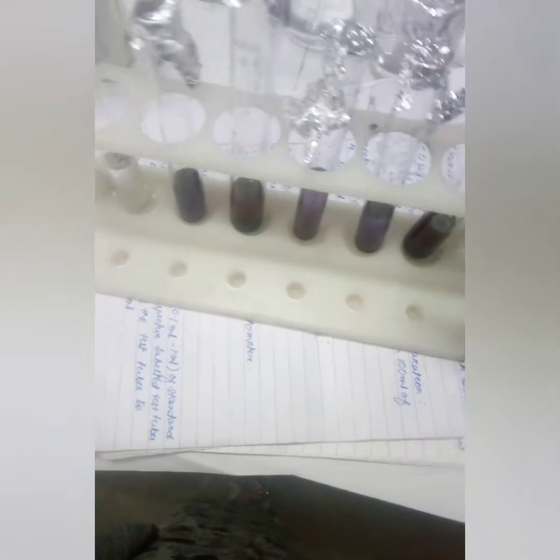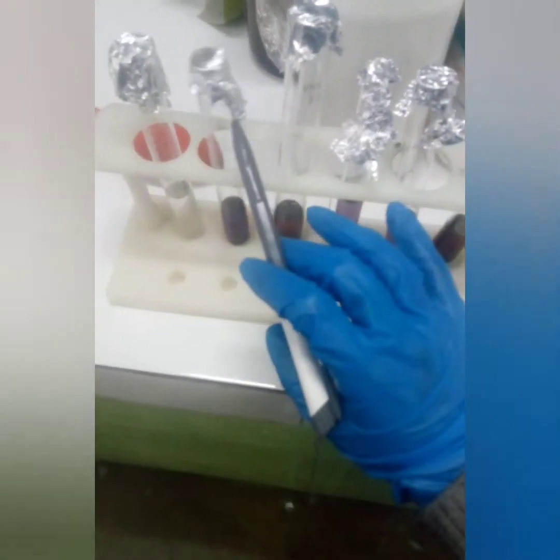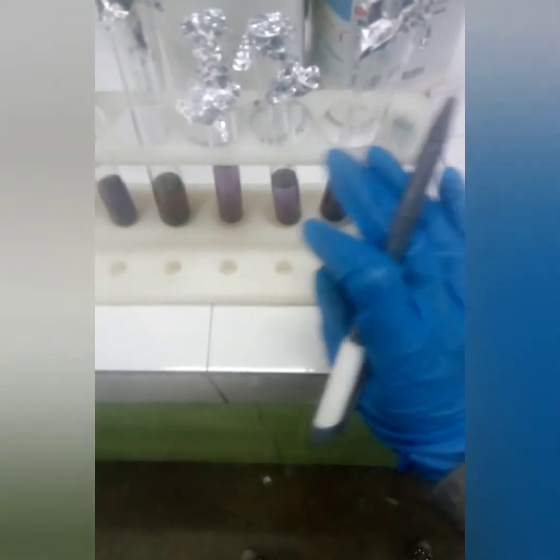So first of all, I will tell you what we are going to do. You see the test tubes. First of all, you will take blank test tubes. Then we will label the first test tube as the blank. Then we have 1, 2, 3, 4, 5 different concentrations of amino acid. Different concentrations of standard amino acids will be added to these test tubes.